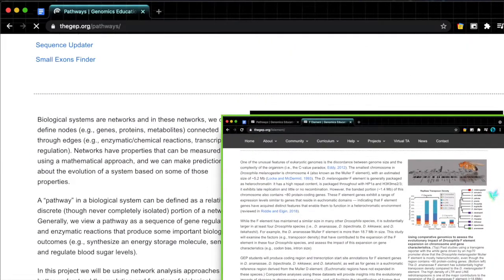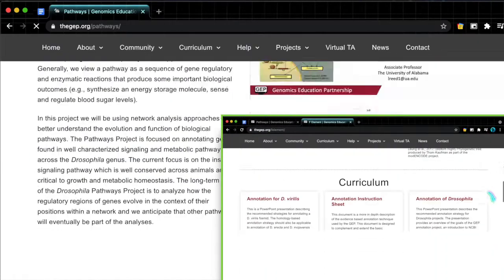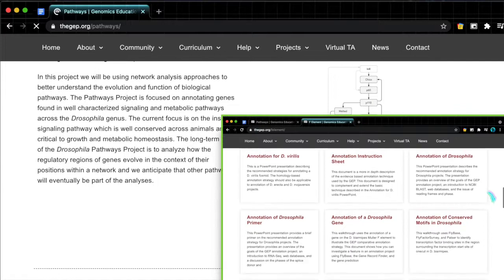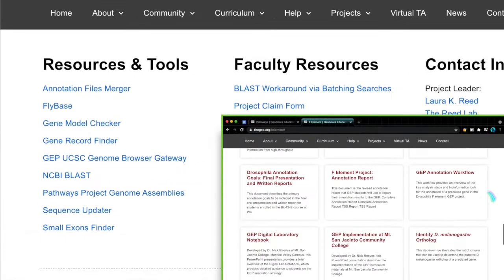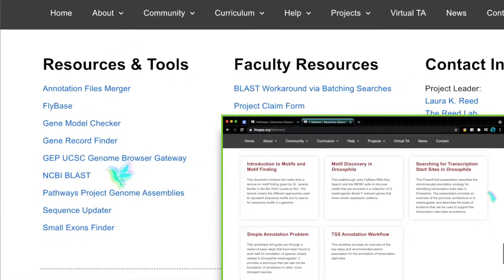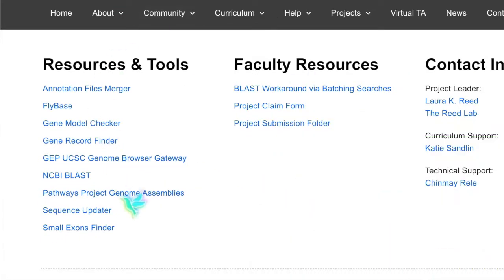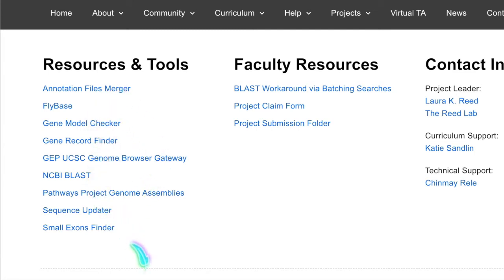Either one you use, I would definitely recommend that you bookmark or favorite that page since it's going to have just about any link you could possibly need for your gene annotations, including the one we'll be using today, the UCSC Genome Browser. So let's go ahead and click on that.